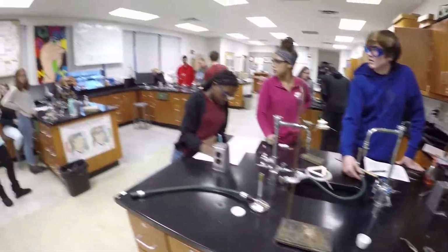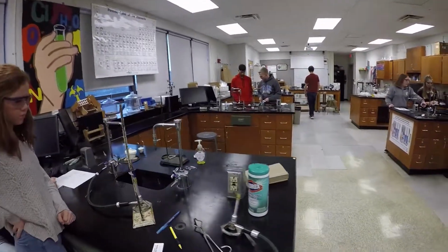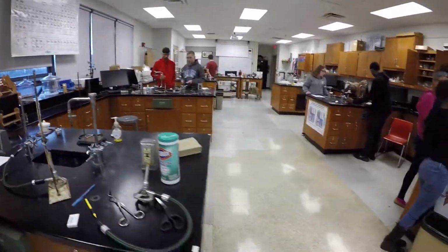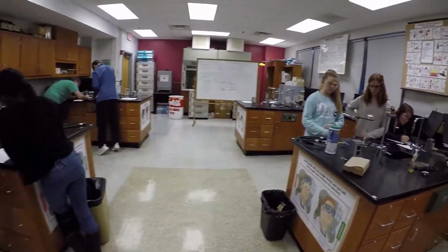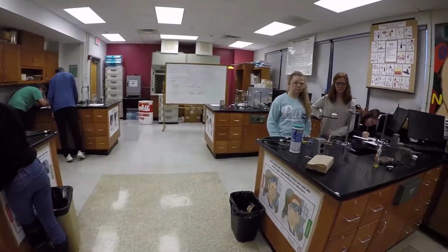That's good. You want it to get really, really hot. It should be glowing red underneath it. That's perfect. Okay. Now give it about 7 or 8 minutes, and then you can take the top off just a tad and it'll let some oxygen in there. Because remember, the magnesium is trying to react with the oxygen. What you're doing right now is getting the temperature up really high so it'll do that.